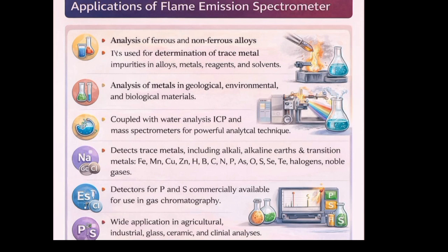Water analysis. ICP instruments have been coupled with mass spectrometers to provide a powerful analytical technique. Most applications of FES have been the determination of trace metals, especially in liquid samples. It should be remembered that FES offers a simple, inexpensive, and sensitive method for detecting common metals, including the alkali and alkaline earths, as well as several transition metals.